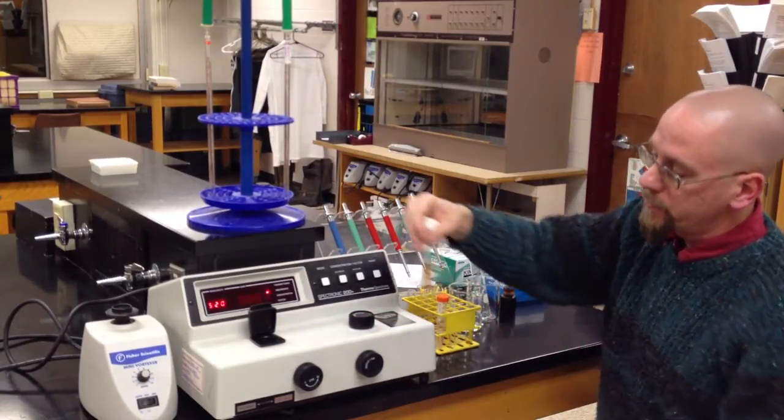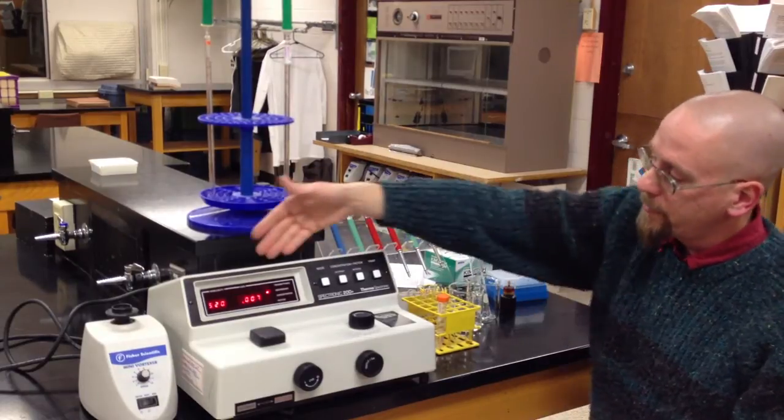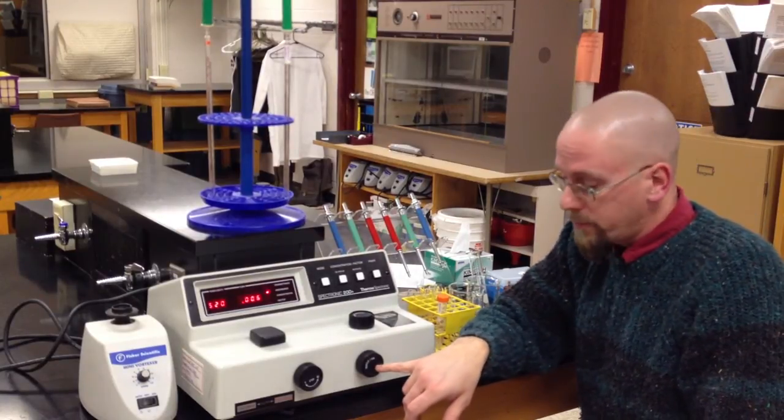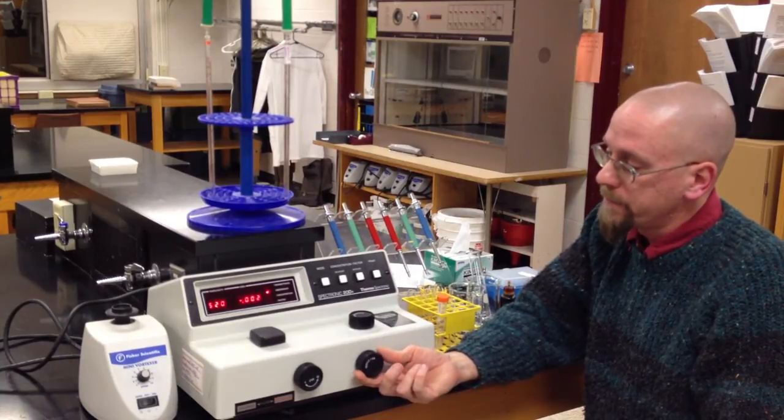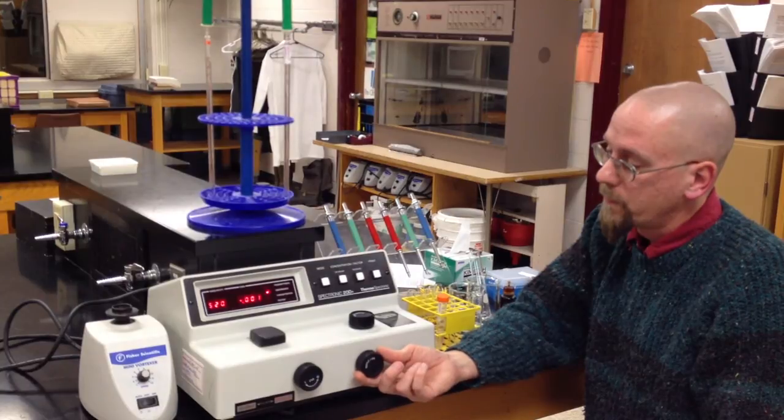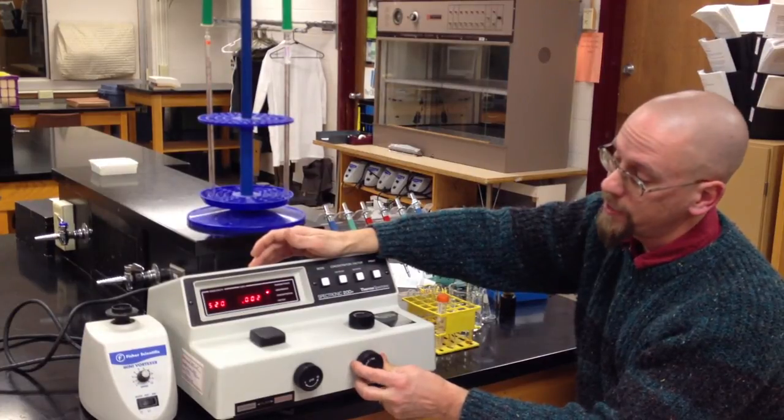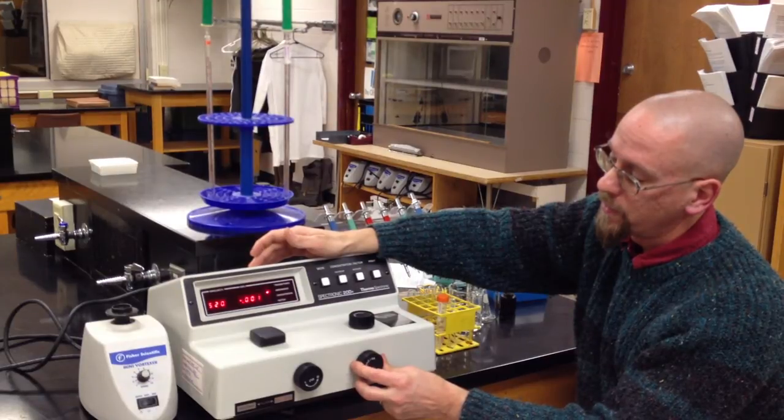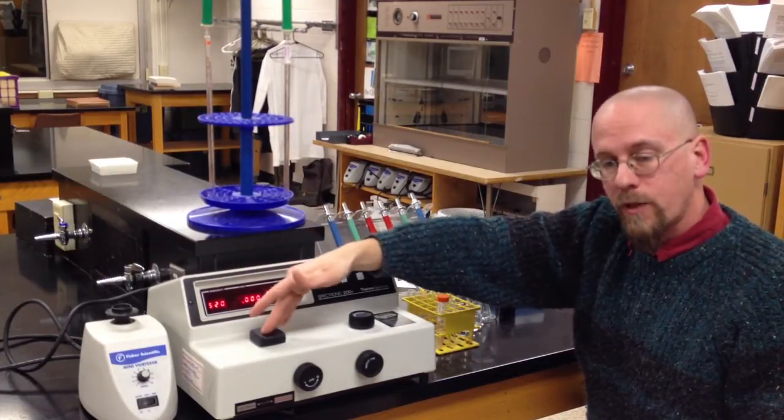So what we're going to do is take this, stick it down in the sample chamber with the score mark and the line lined up, close the lid, and now my absorbance changes. What you want to do is use this right knob and turn it to set the absorbance to zero. It's really sensitive. I've set the absorbance to zero with a blank that has water and iodine.